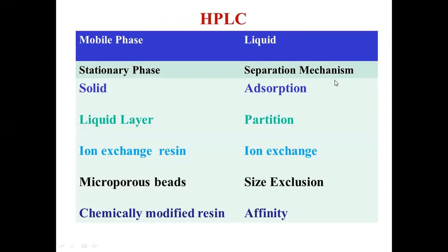So look at the principle of HPLC. High performance liquid chromatography or high pressure liquid chromatography is a chromatographic technique which is used for the isolation, separation, characterization, and quantification of the analytes present in a variety of samples, whatever may be the origin of the sample.